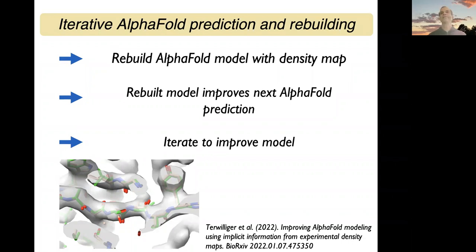And all the data from all the structures are there, including instructions on how to reproduce that data and ChimeraX sessions so that you can see all the results. And so you can evaluate exactly what's happened for all these cases yourself. And none of these were selected. I just took, at the time of running this, the 25 most recent structures that had between 200 and 1,000 residues that had CryoEM data that were suitable.